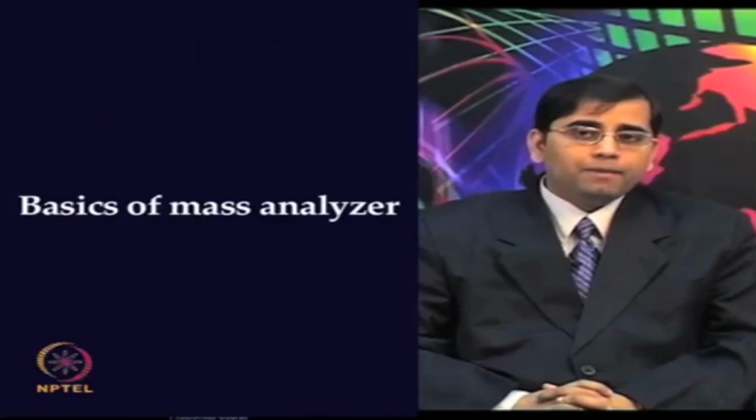There are different types of mass spectrometers currently available, but for proteomics there are two configurations which are most often used: the quadrupole time of flight or QTOF based configurations and hybrid linear ion trap Orbitrap instruments. The TOF configurations separate peptides in time as they reach the detector, so the time of flight is measured, whereas the Orbitrap mass analyzers measure the frequency of peptide ions oscillating in the ion trap. Different resolution and sensitivity can be obtained from each of these configurations.